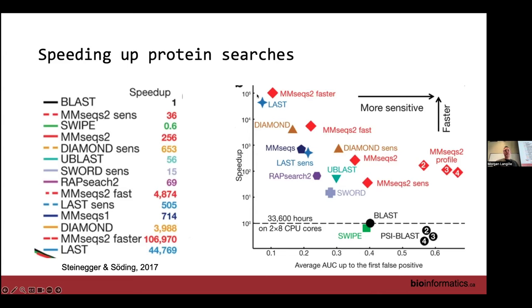And the idea is if you can do that, then you can dig in a bit to the function. So I love it if you've done the unstratified analysis, you see what functions are interesting. And then to me, it's great to dig into the next level and say, is that driven primarily by one species that you already showed is different? Is it driven by a whole bunch of different species? And the interpretation is a bit different there. Yep.